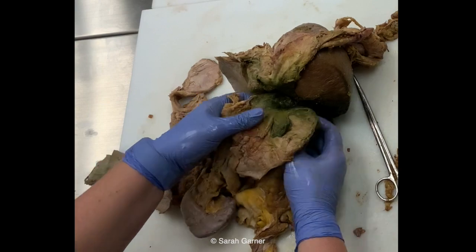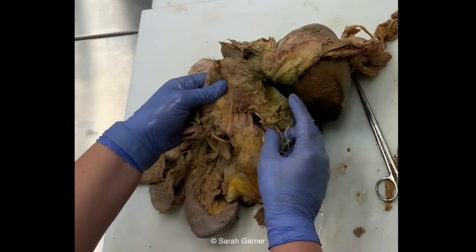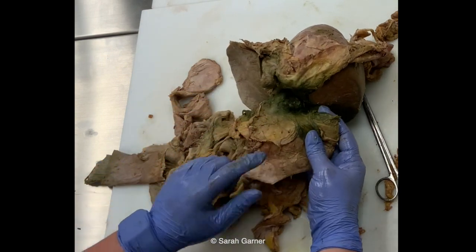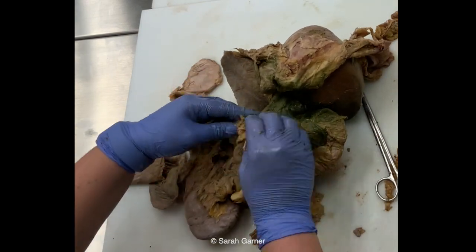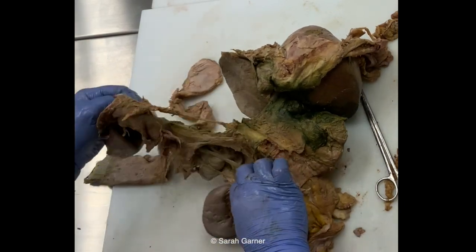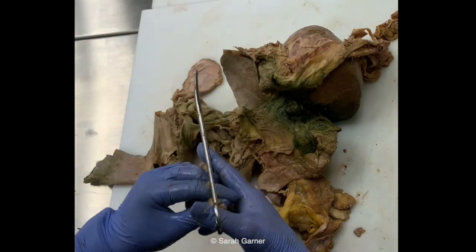So basically what I have going on right now is the inferior vena cava is reflected up. You're seeing the very edge, the pylorus here, duodenum. So this is like the head of the pancreas and then the uncinate process from the back right here. That's what we're seeing. So with that, you want to separate this as best you can. So this is the remainder of that diaphragm. Oops.